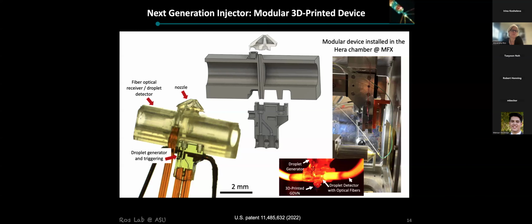It's one final piece. We have our droplet detector integrated here. And then potentially, as you will see later, we can couple this with mixers for time-resolved work. We would also be able to achieve shorter time points with this assembly. So this is the modular droplet generator that we developed.